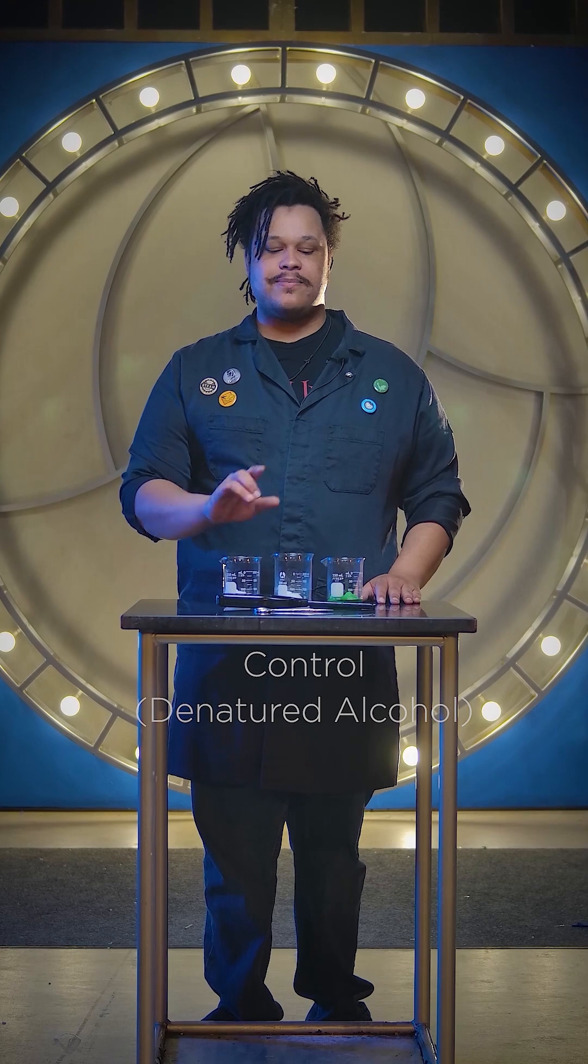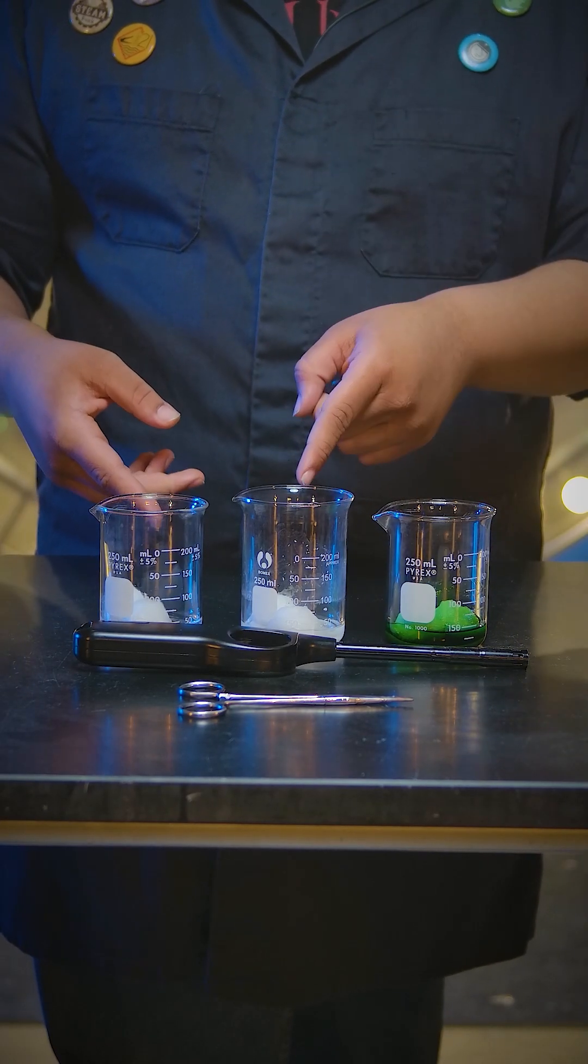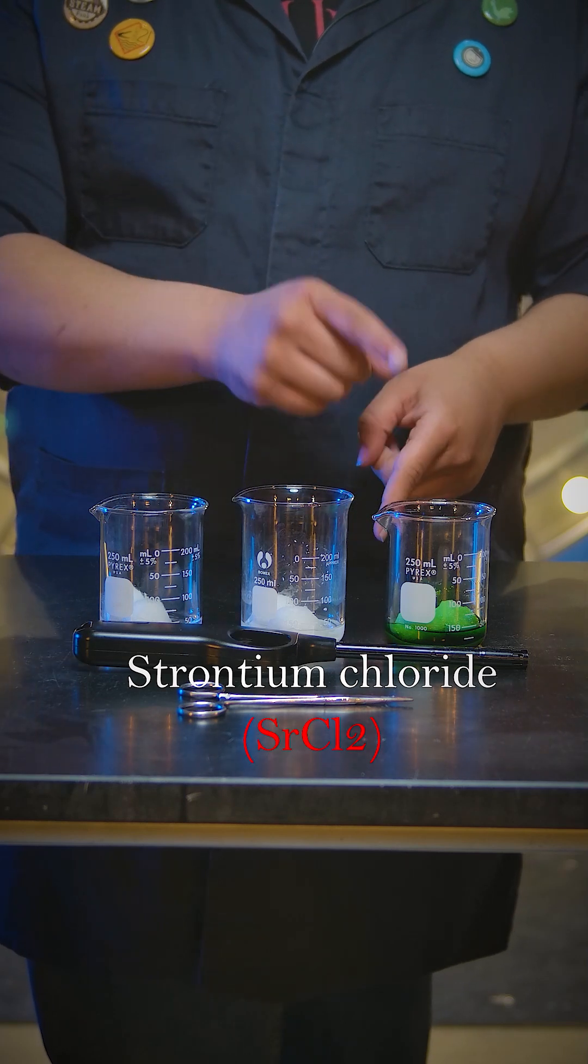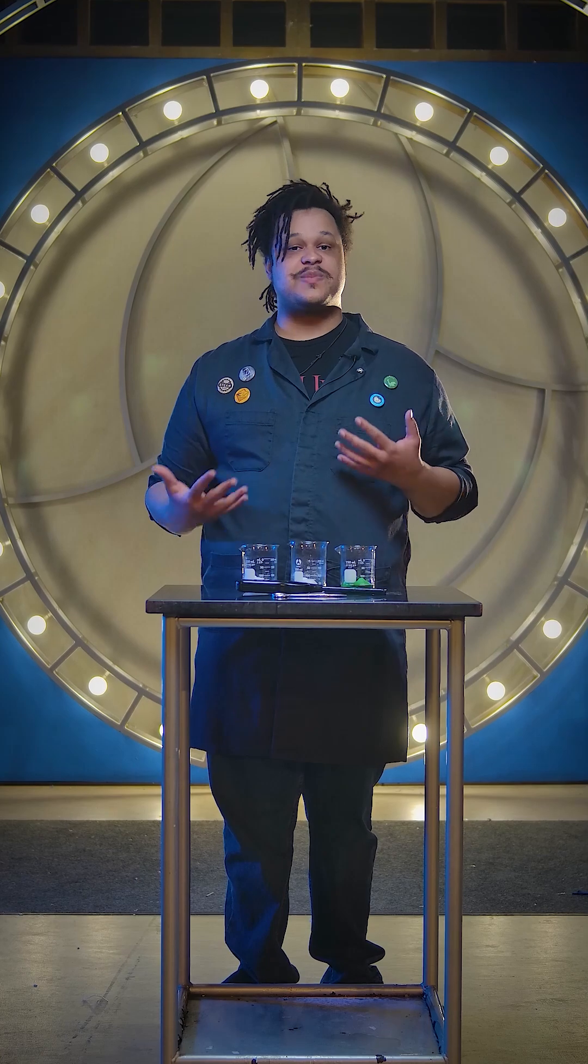in it along with our cotton balls. But these two on the other hand contain both denatured alcohol. This one happens to contain strontium chloride and this one over here contains copper 2 chloride. These are actually some of the chemicals they put in fireworks to give them their special colors. Let's kill the lights and see how this looks.